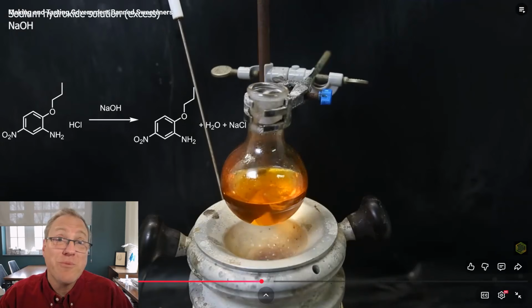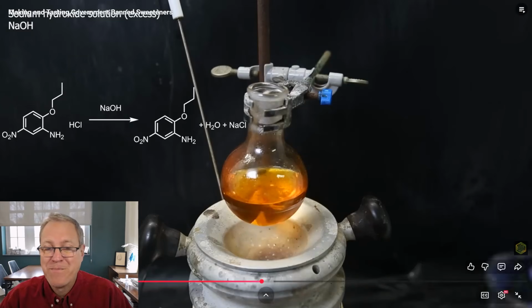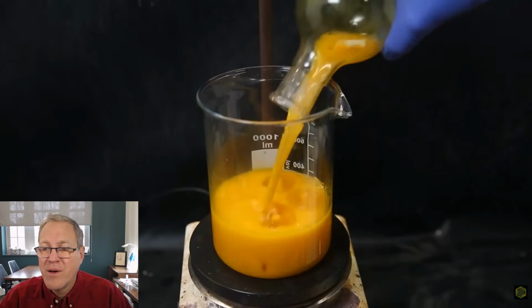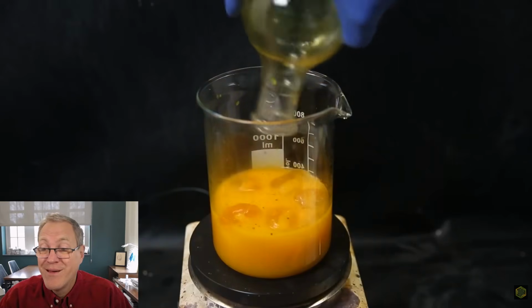So he just threw a bunch of base in this strong acid solution. And he's like, okay, let's cool it off a little bit too. He gave it a little bit of ice. Solution becoming basic is evident by it turning cloudy, and the product settling out as an orange-red oil. I then pour it all onto ice to... Again, the pour onto ice, I can't stand it, but it doesn't matter. It's working for him. Cool it down and solidify the product.